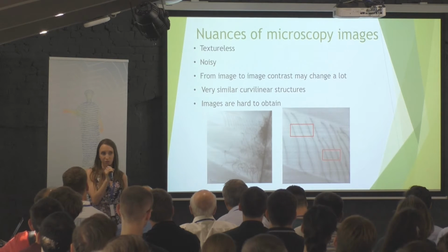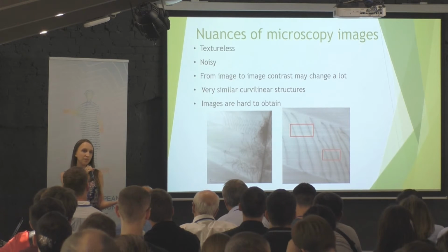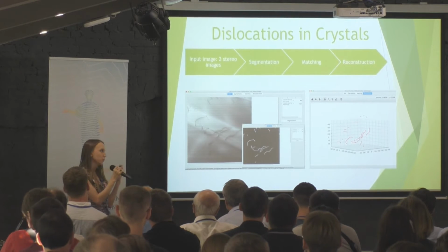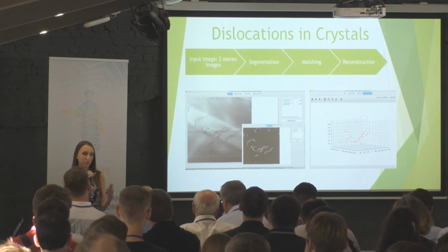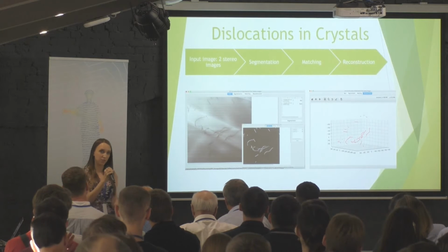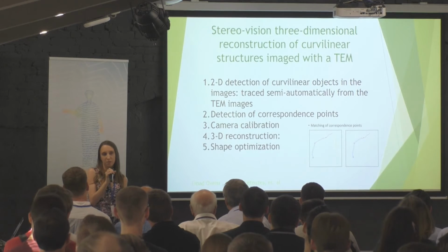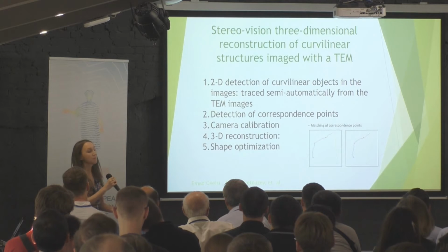It's really noisy sometimes, and it's really hard to find the right conditions to obtain really nice images without additional artifacts due to the acquisition process. So the structure of how it's done now is like this. It's manual. You manually segment both stereo images, you manually match them, selecting multiple key points, and you manually reconstruct it. It's super time-consuming. And now there is another work that was done at EPFL. It's a little bit better because segmentation is done semi-automatically and the rest stays the same.